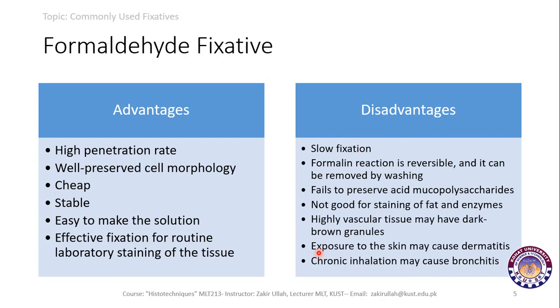It is a toxic solution, and continuous chronic inhalation causes bronchitis in the person who is working with the formalin. So, these are the disadvantages of the formalin solution.